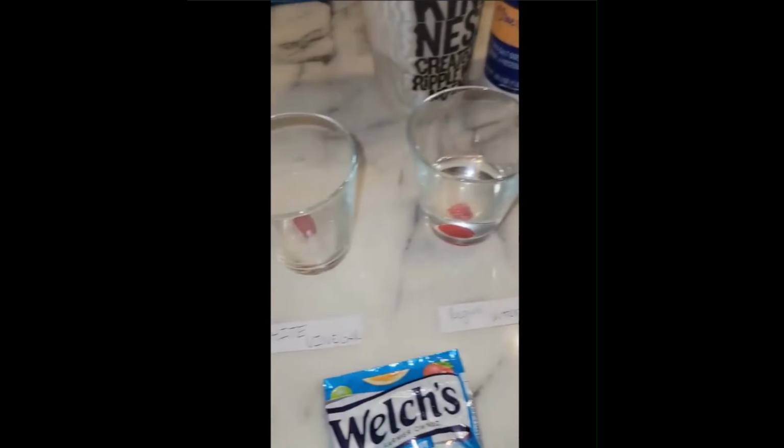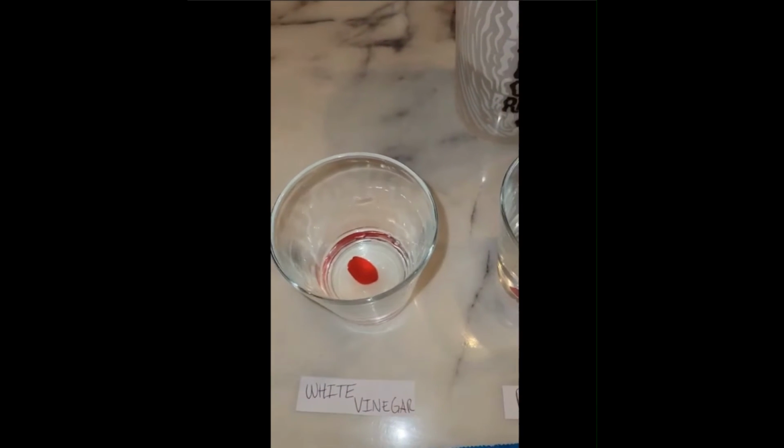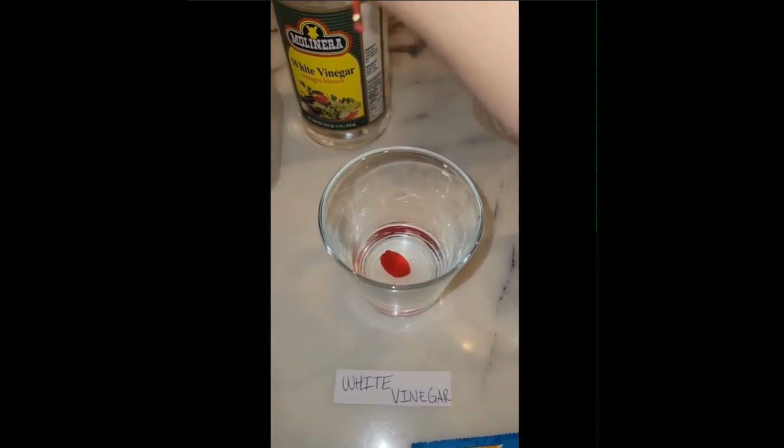Then I added some white vinegar to the white vinegar cup. And finally, I added some alcohol to the last cup.